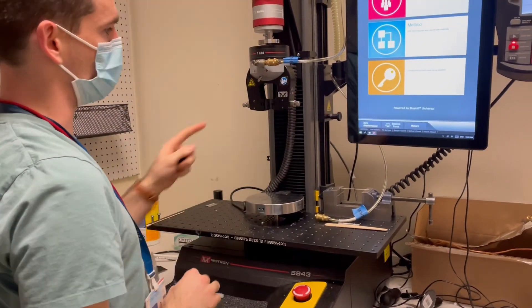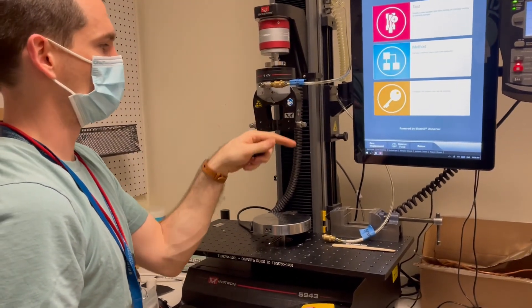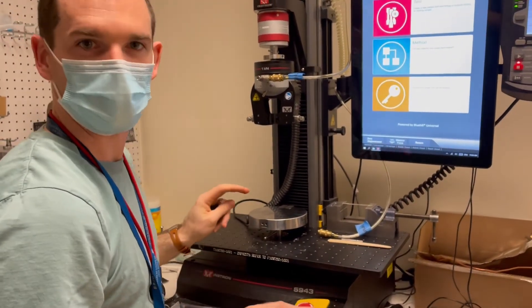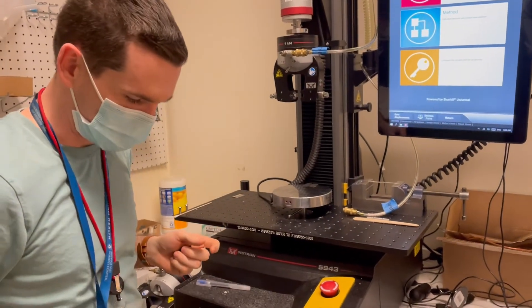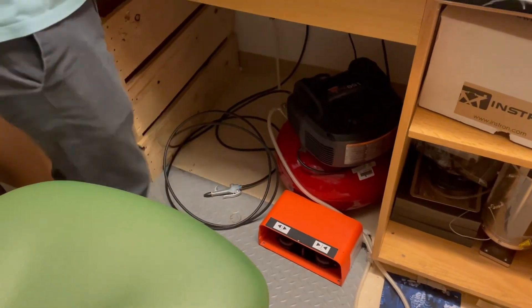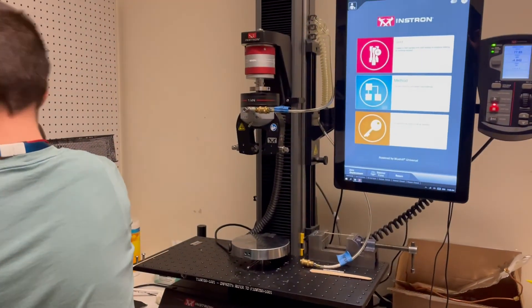For safety, make sure that you never put your fingers in here and have the grips close on you, because they'll crush your finger with quite a bit of PSI — you definitely don't want that to happen. Also note there's a foot pedal down here which can also close those grips, so don't have your foot by the close button while your fingers are near the grips.